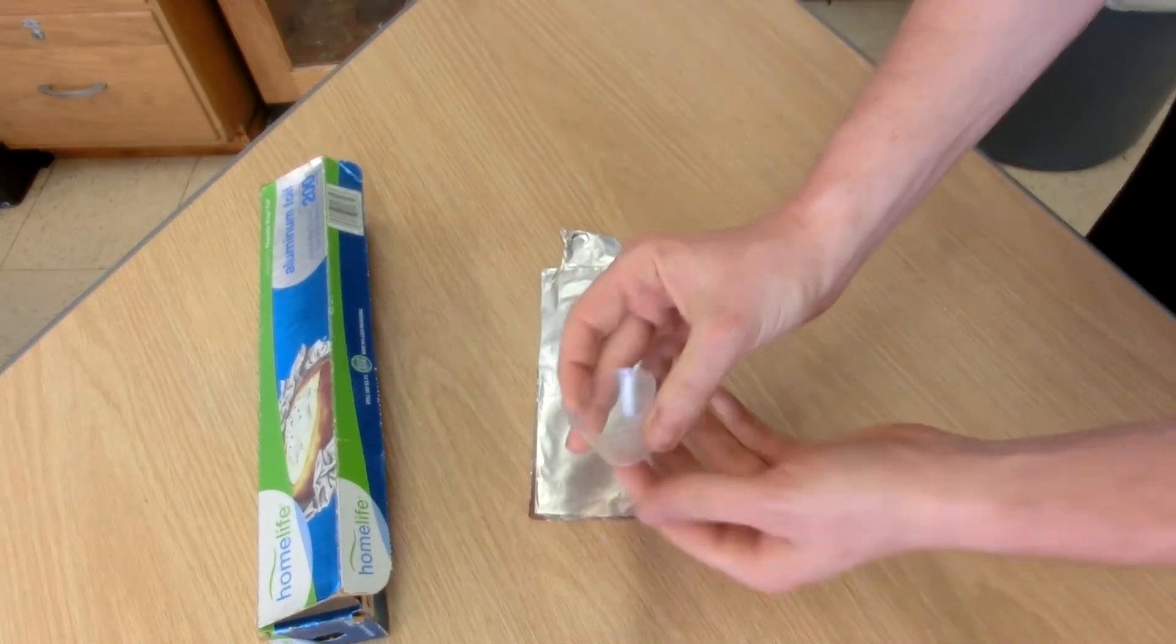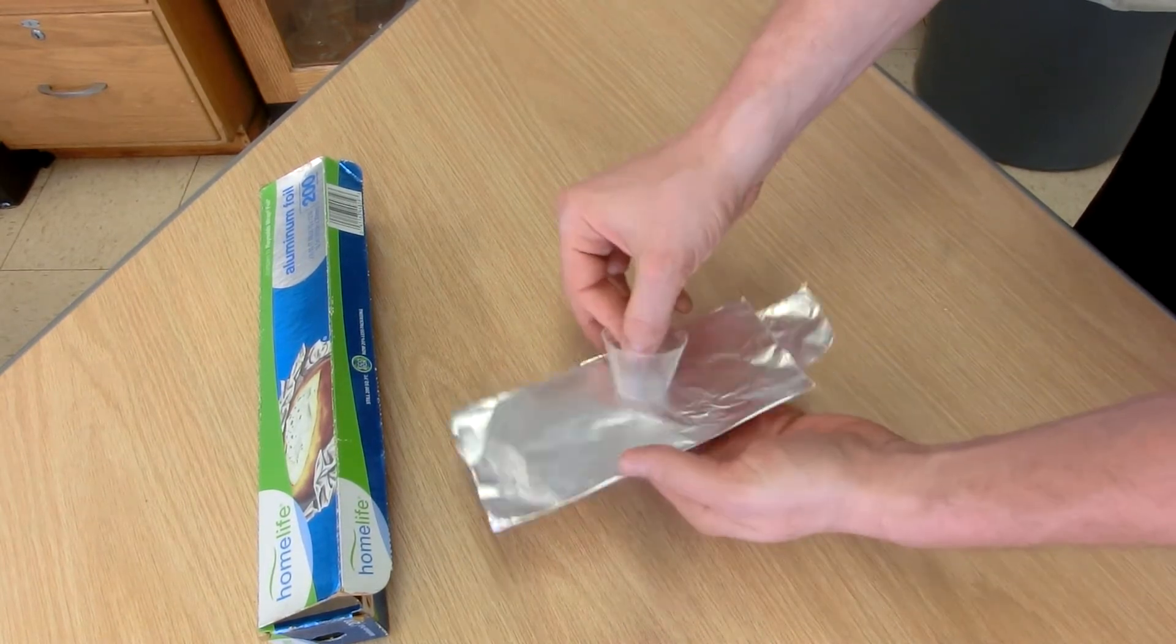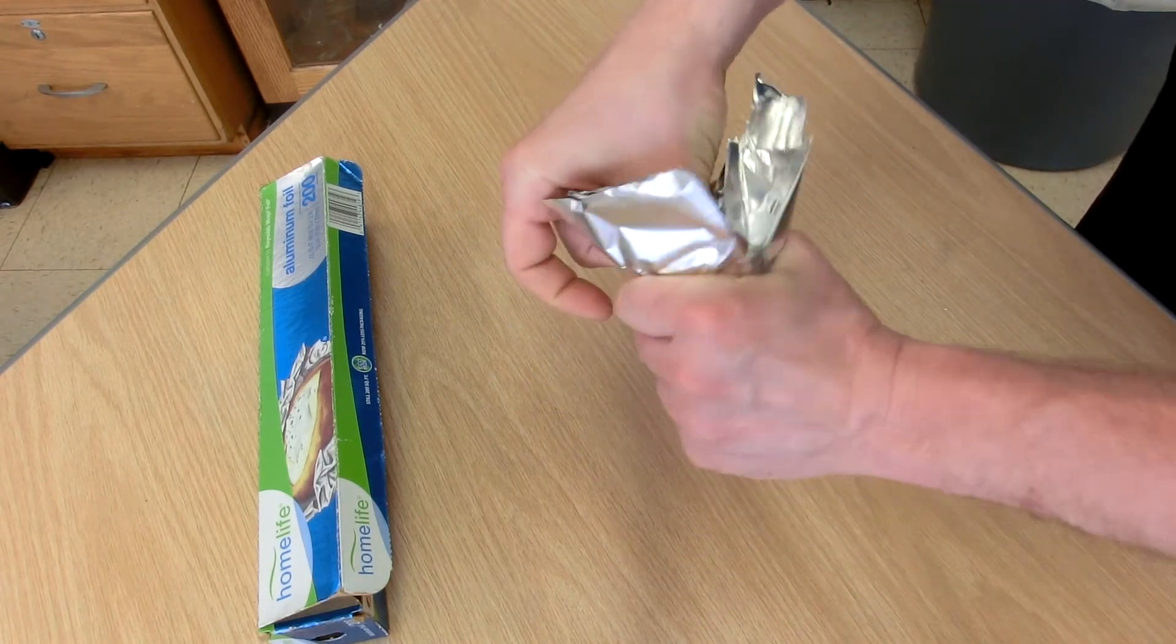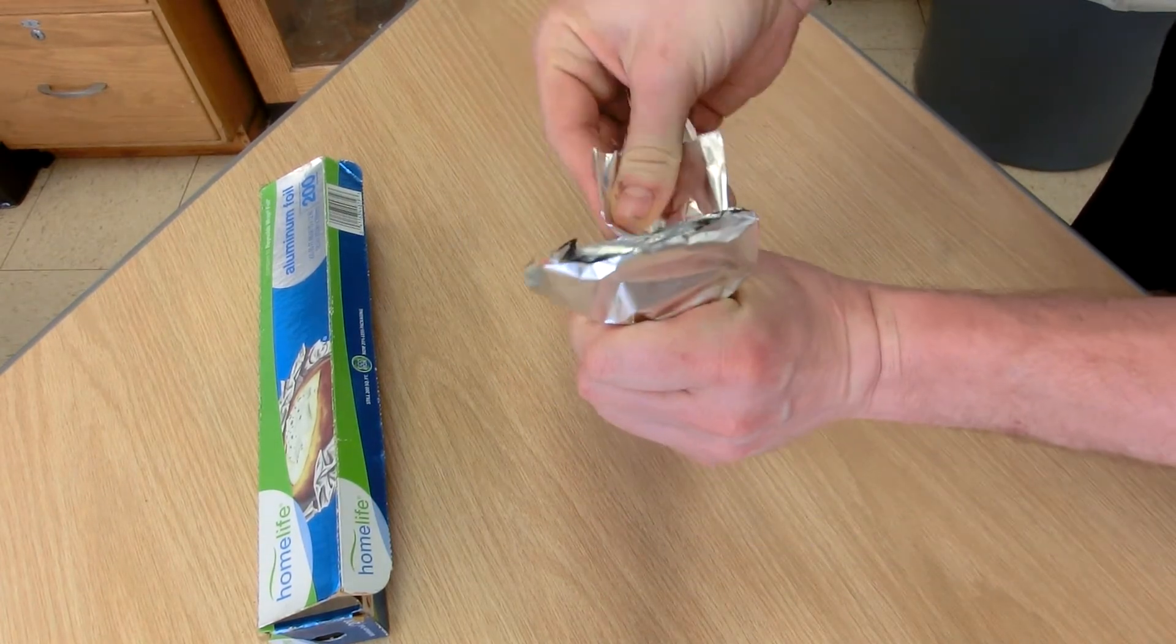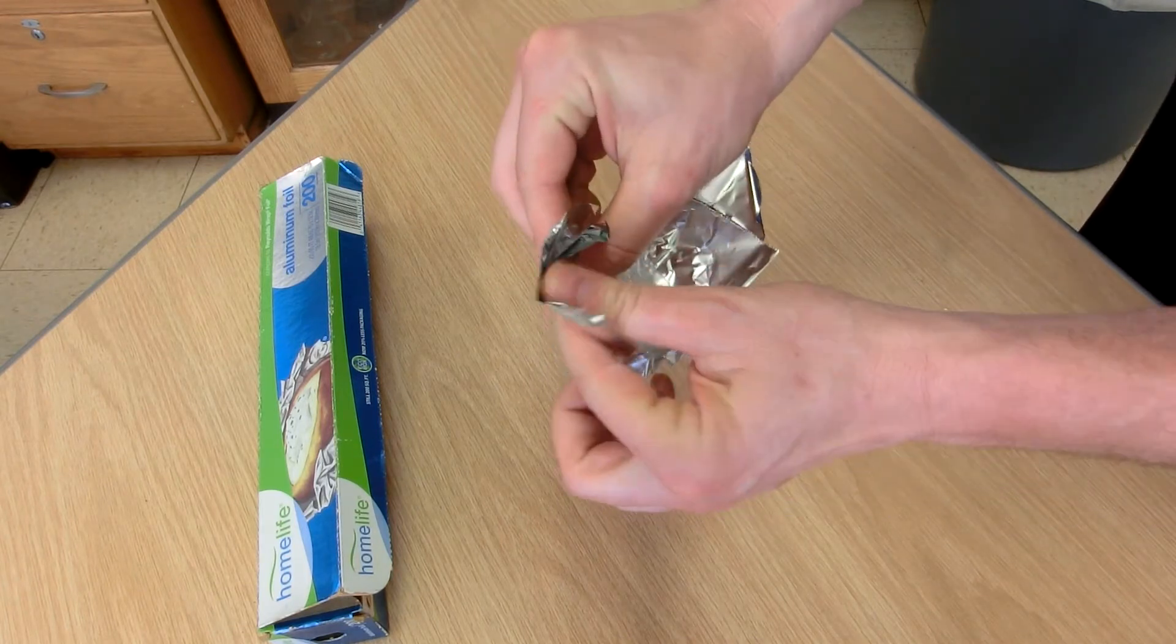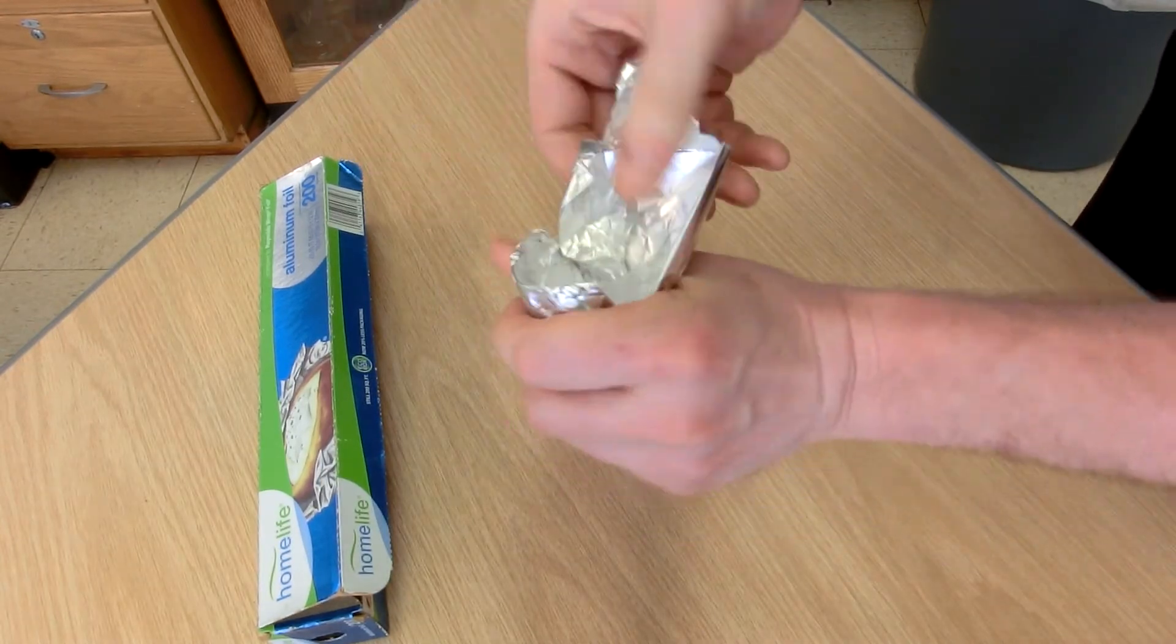Then I took these medicine cups that I had around my classroom and wrapped the foil around the outside. You can either trim the edges with scissors or just fold them down across the top and around.